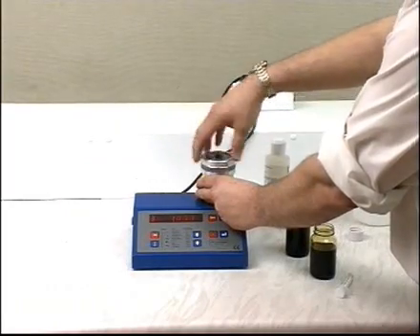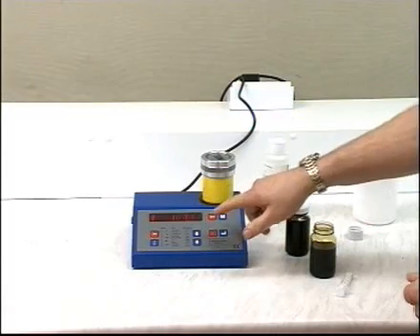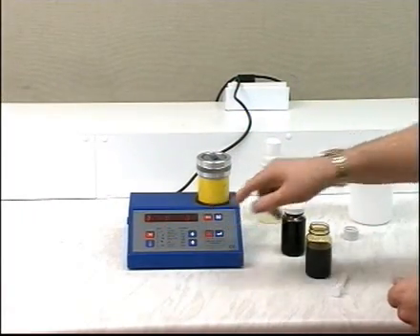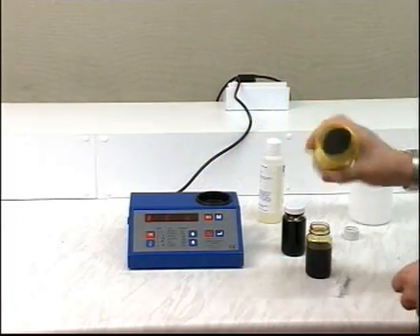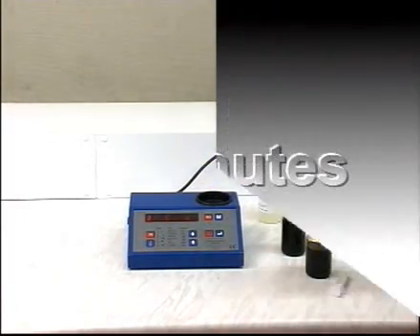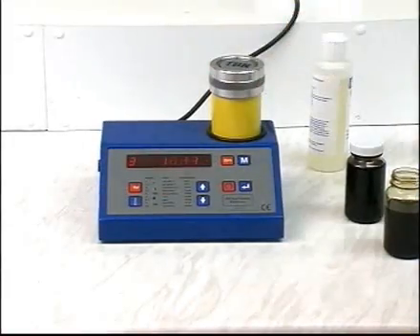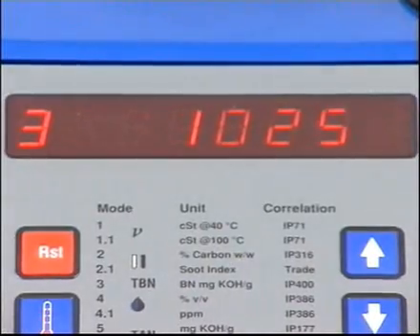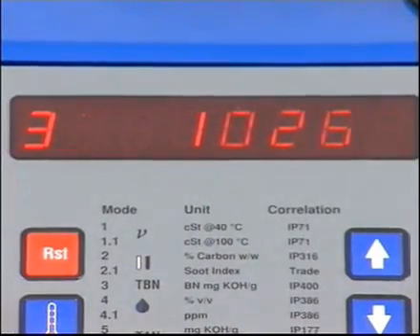When the reading is steady, press the button marked 0 to start. Remove the cell and shake it until the display reaches 120, then replace it on the unit. You must shake it vigorously or the test won't work. The unit will now display the reference value for the new oil, which will be used for testing used samples of this batch of oil, so record it in your logbook.